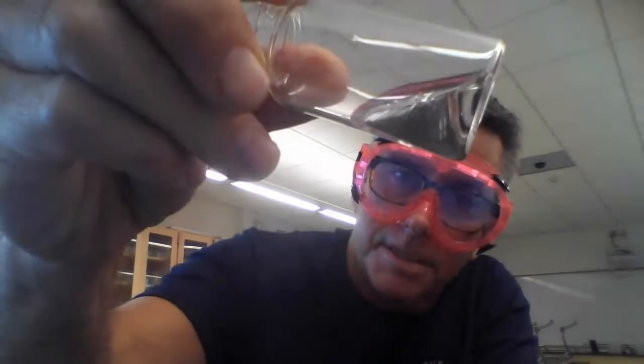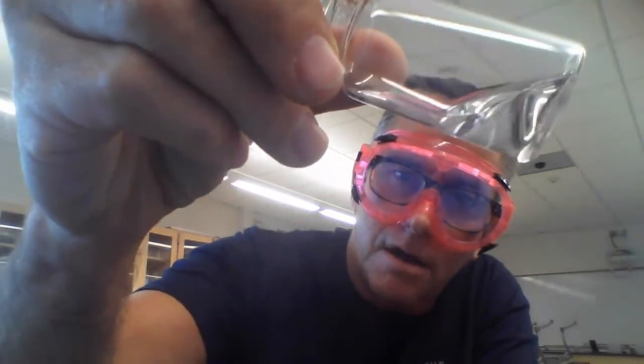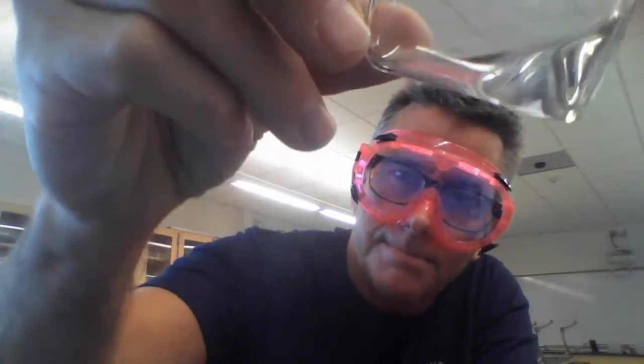And the last one is called butanol. That's B-U-T-A-N-O-L. This one has 4 carbons, and I wonder if you can, does it look thicker, perhaps, when we do that? Seems a little bit. Unpleasant is the way I'm going to describe this one. Okay, let's bring in another student or teacher and see what they think.